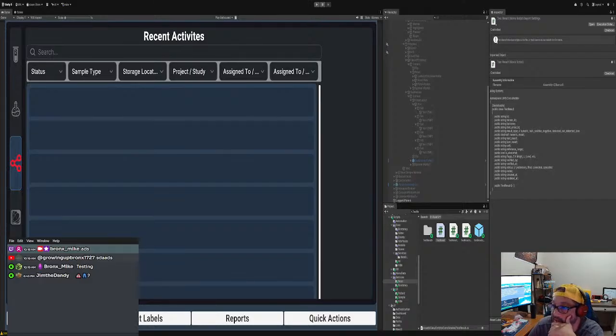I'm sorry. So the pattern is this, right? Every table should get a service, I forgot the name of that pattern. Every table should get a service, just for it, right? Or if you combine tables and stuff like that, let's say we have a patient sample. We need the patient, and then all of the samples connected to that patient. So what we do is we have a bunch of methods for it.